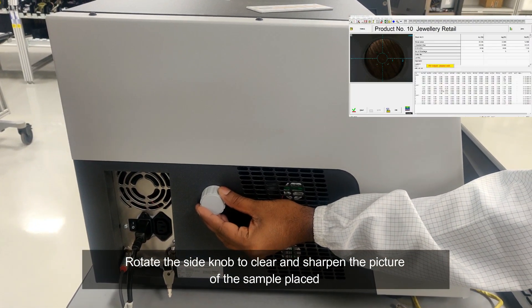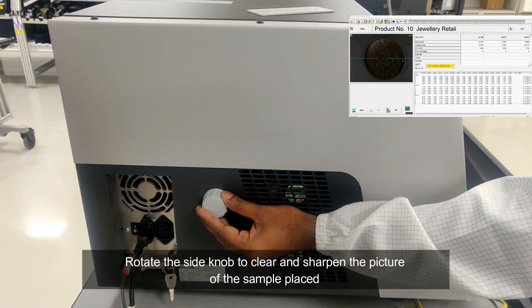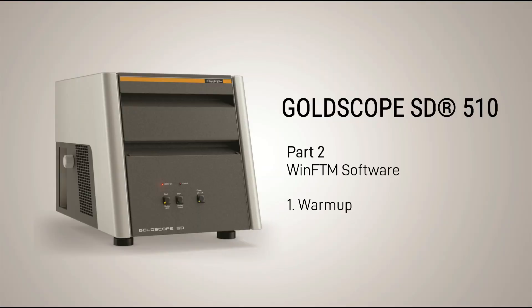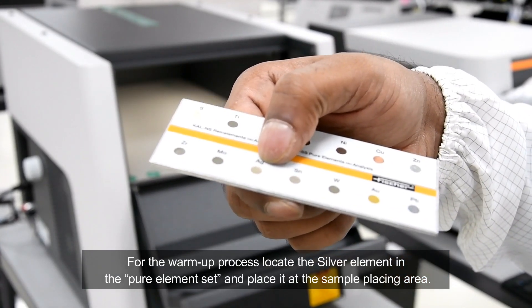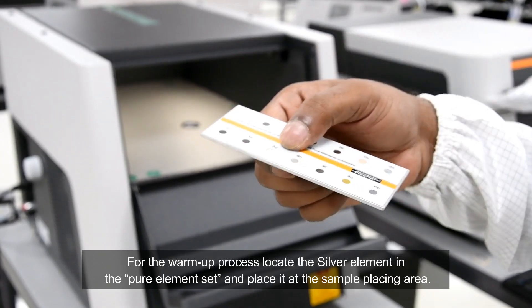Rotate the side knob to clear and sharpen the picture of the sample placed. For the warm-up process, locate the silver element in the pure element set and place it at the sample placing area.